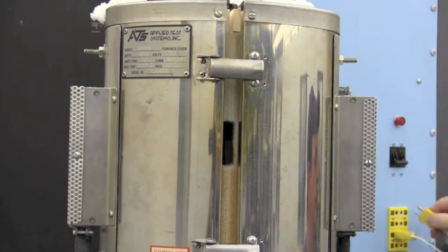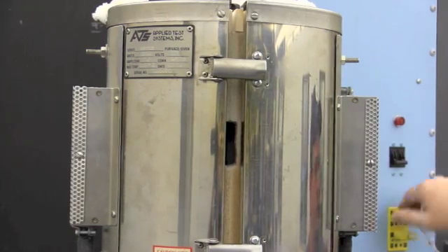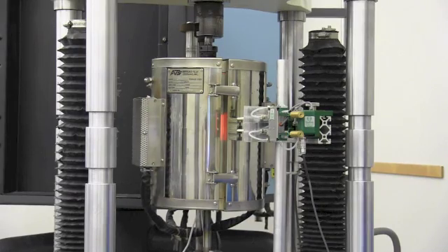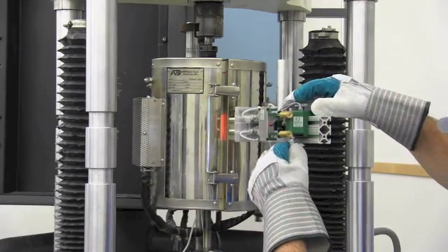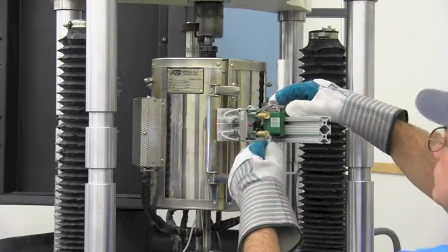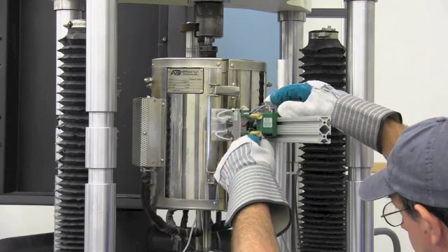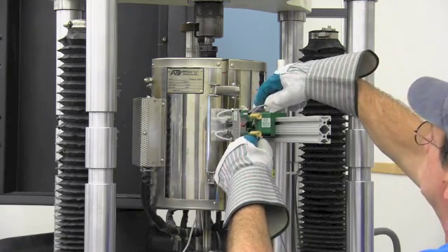The specimen is held at temperature for a minimum of 30 minutes before applying load. A slight preload is applied and the technician then mounts the extensometer onto the rail and slides it into place so the high temperature ceramic rods contact the specimen.